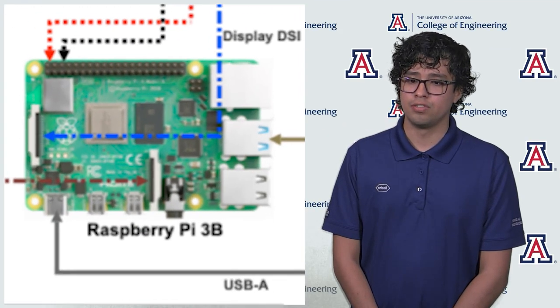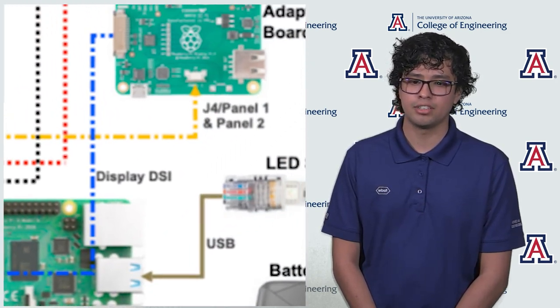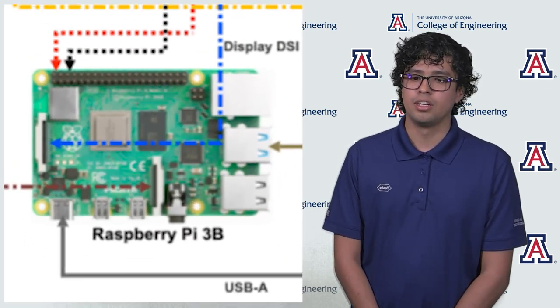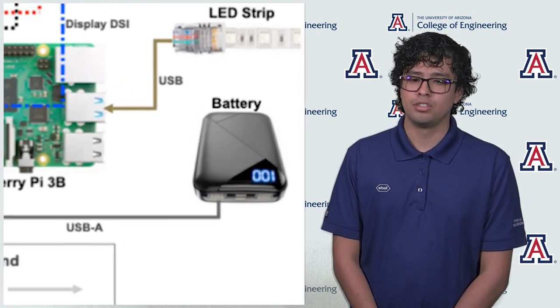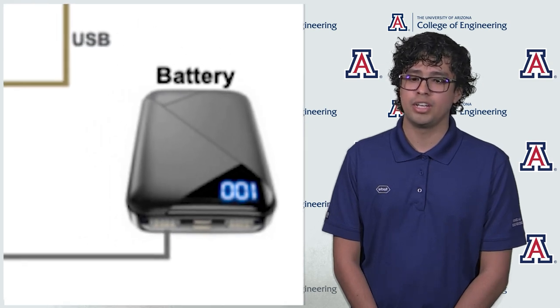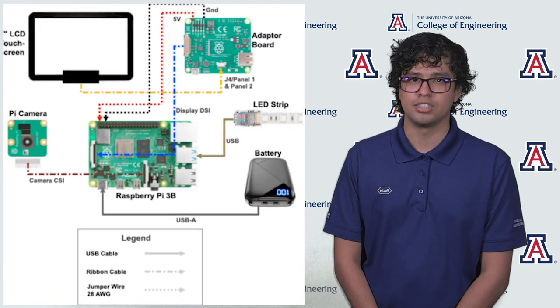The electrical system consists of a Raspberry Pi that communicates with the Pi camera, LED strips, and an adapter board. The adapter board then communicates with the touchscreen display, which allows interaction with the Pi. All electrical components require 5V output in order to be powered properly. Therefore, a 5V rechargeable battery with a capacity of 10,000 mAh is connected to the Raspberry Pi to power the entire system.